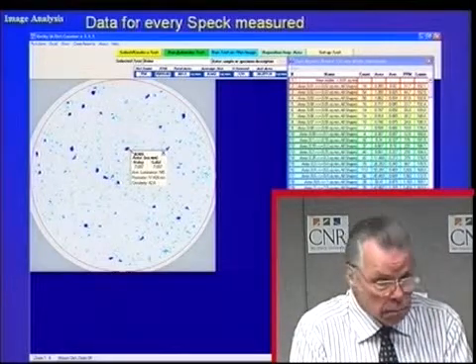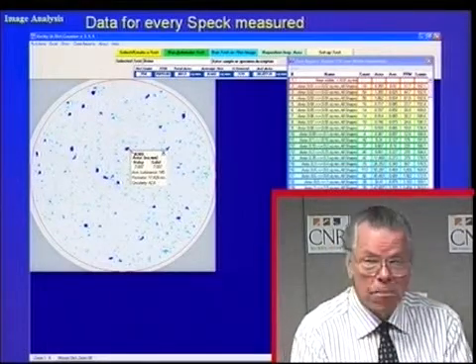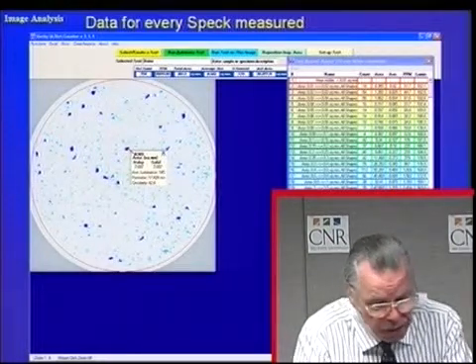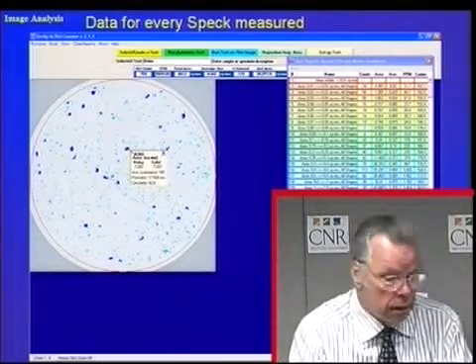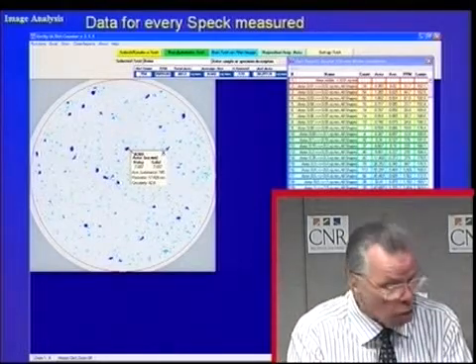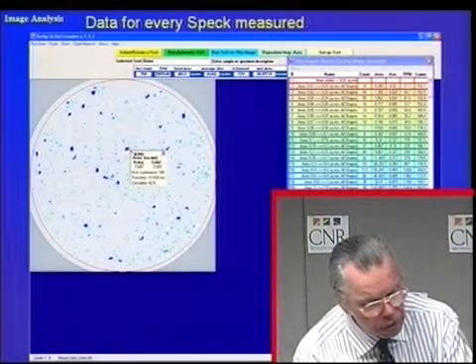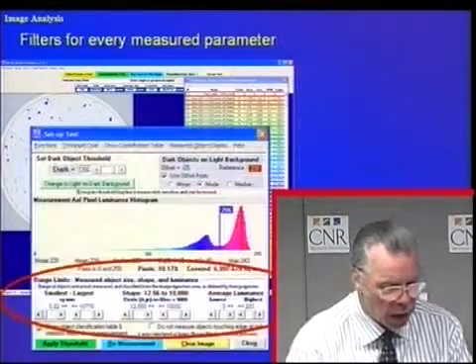has a hole in it, the area is different than the area subtended by the perimeter. So the subtended area is the solid area, and the holey area is the area with the holes in it. So we report both of them. Sometimes it is important in process control, depending upon what stock you are measuring.